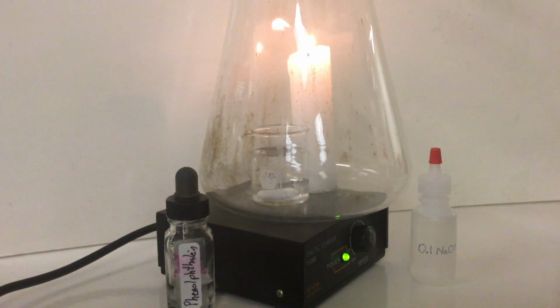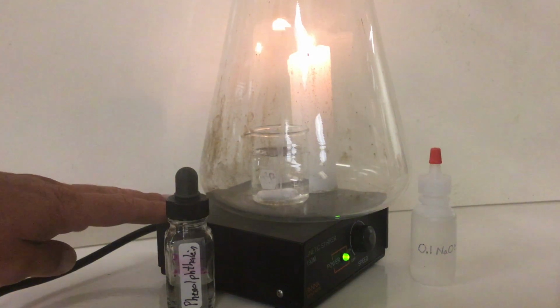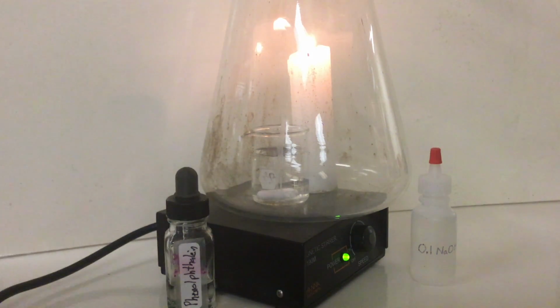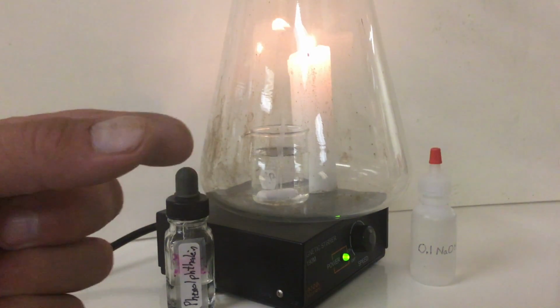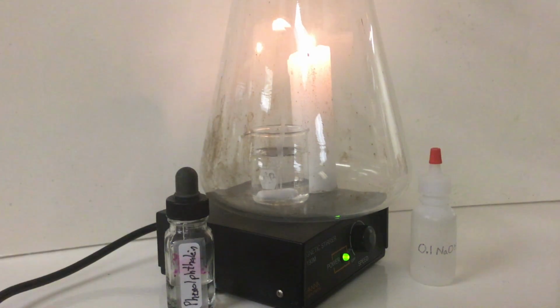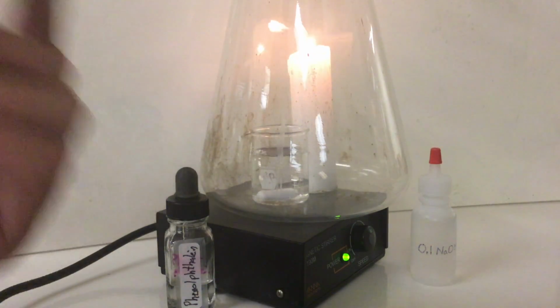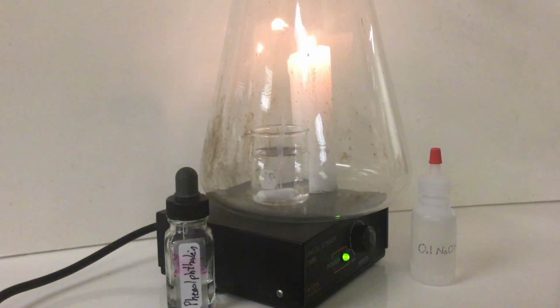Then I have a wax candle that is currently lit. And this is sitting on what we call a magnetic stir. It's plugged in, it's an electronic device, and it turns a magnet, an electromagnet. And then there's also a tiny little pill-shaped magnet inside that beaker, which is in the flask. And so as this magnet turns, it also turns that little pill. And so that can stir the liquid inside that beaker.